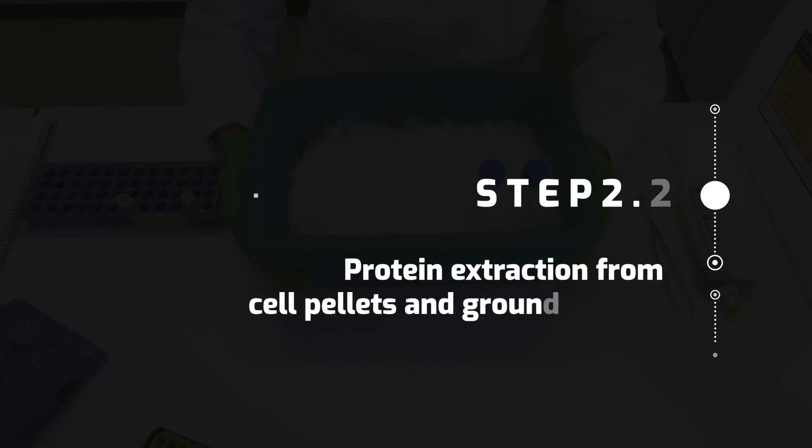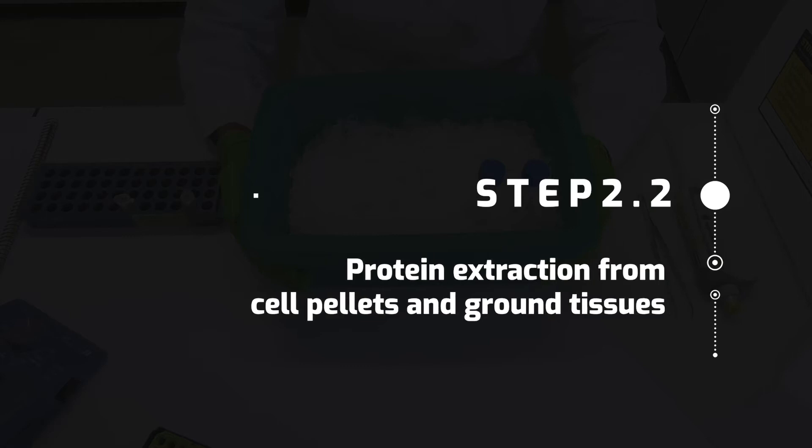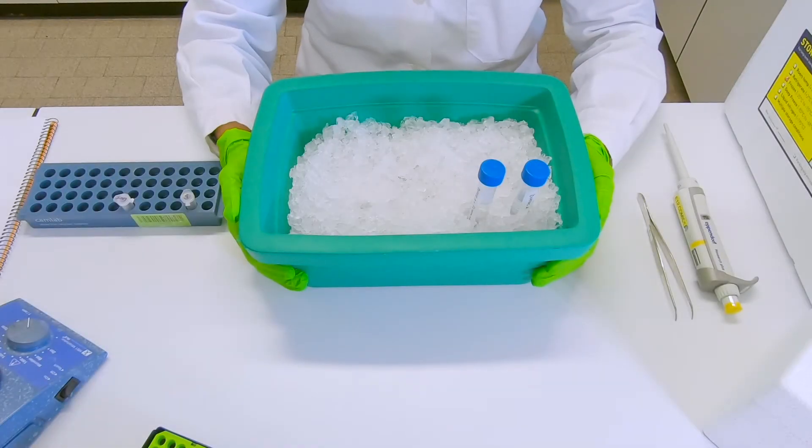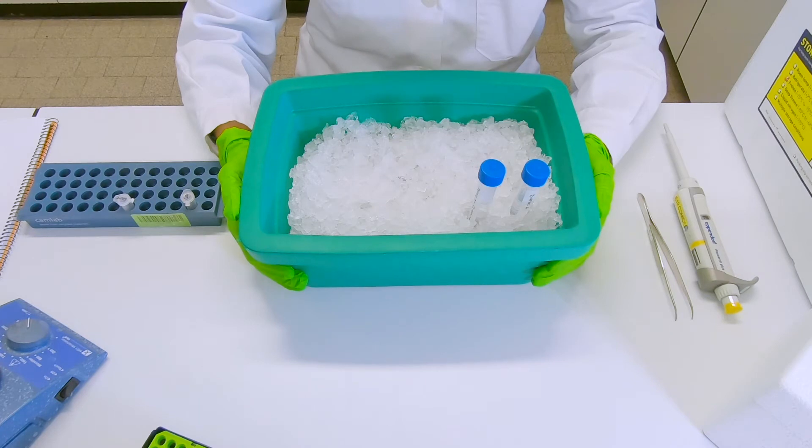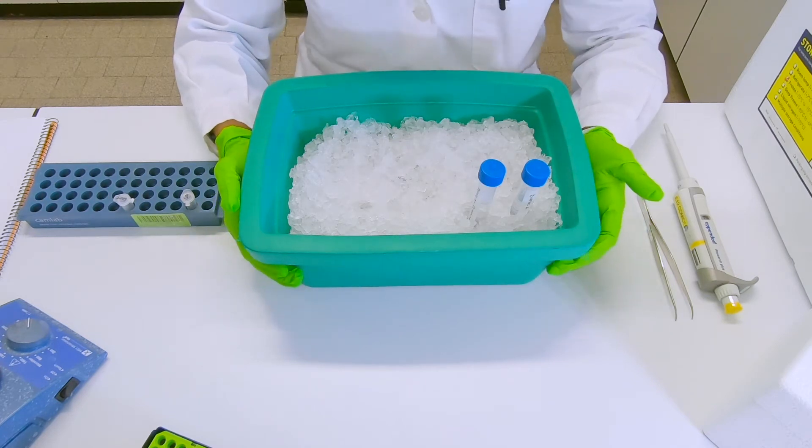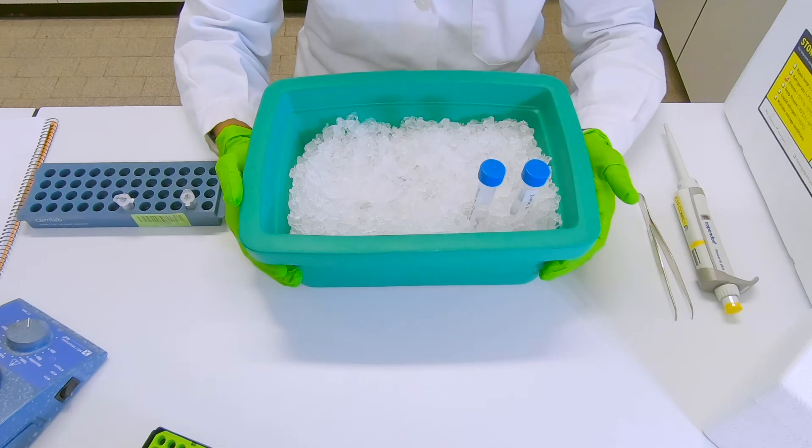So now we're going to show you how to extract proteins from materials like cells or tissues. You can either work from frozen cells that have been frozen, for instance with DMSO, but then you have to wash them and make a cell pellet. Or you can use as starting material a cell pellet, which is frozen as a cell pellet. And in parallel, we will show you also how to extract proteins from ground tissue.